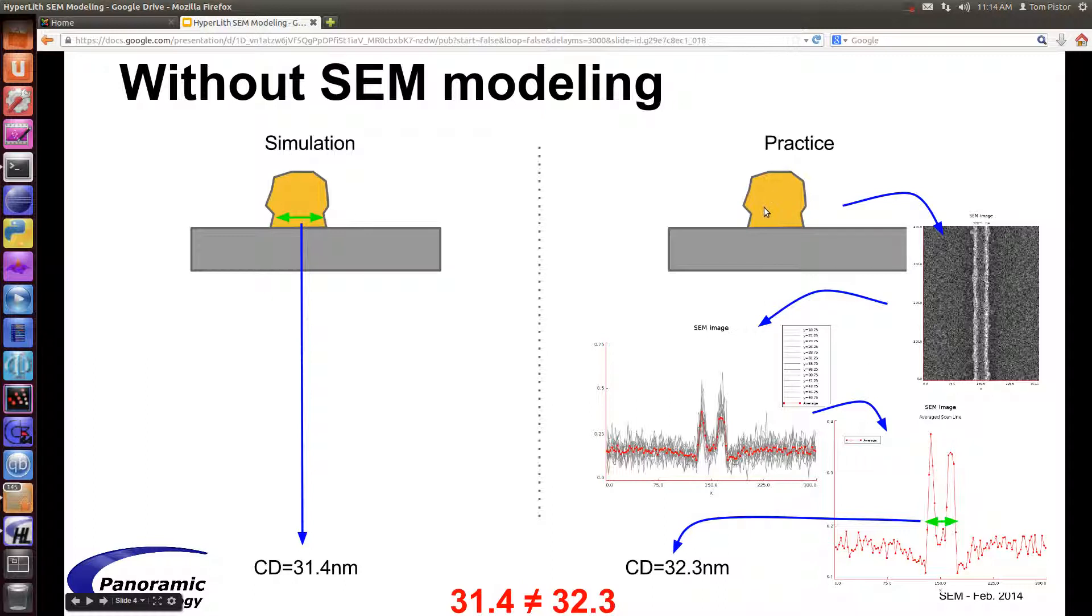But in practice, you can't measure this feature directly. You have to form a SEM image of it. The SEM image gives you a SEM signal, or in this case, several SEM signals that are averaged across 12 cut lines. You're averaging in the Y direction, the cut line is in the X direction, and then you get a SEM signal which some algorithm measures. What you measure in your simulation may be different than what is measured from the SEM image. This is not an apples-to-apples comparison.